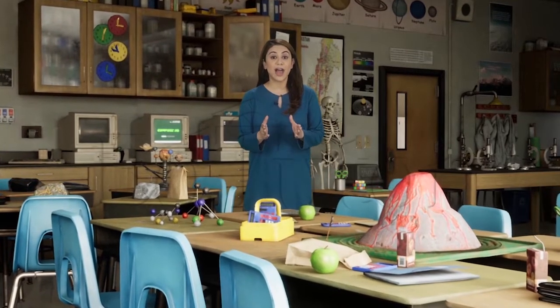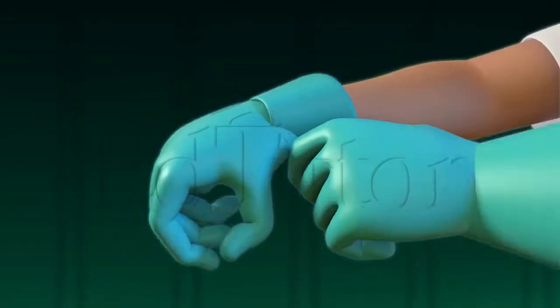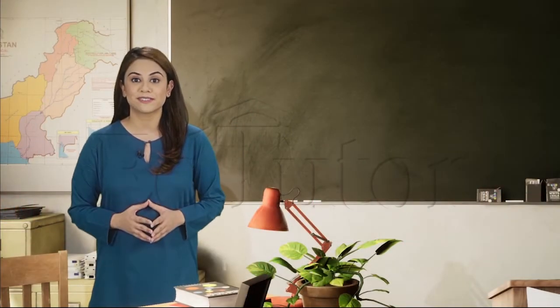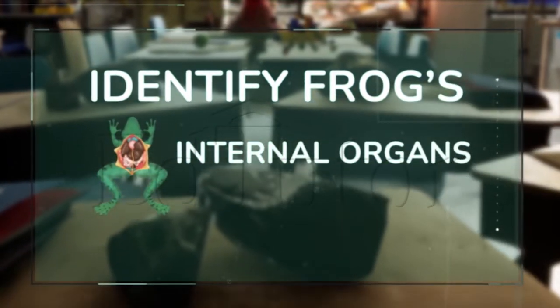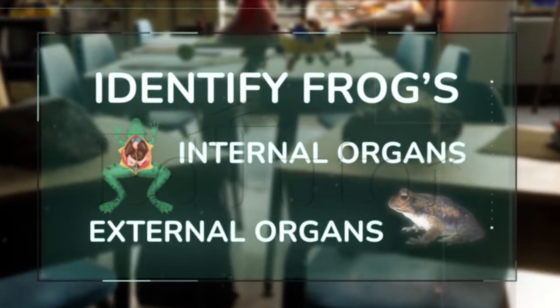Hi friends! Before we end this lesson, I have a really cool and exciting experiment for you. So, put on your lab aprons and goggles and get ready. Because what we are going to do today is dissect a frog. We are going to try and identify its internal organs and see its external and internal structure in more detail.